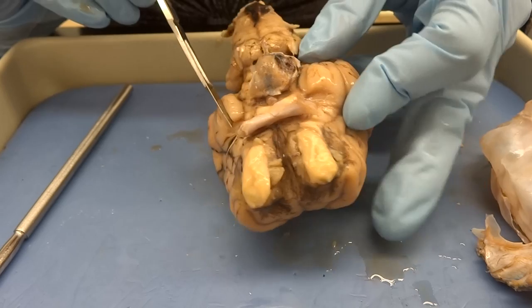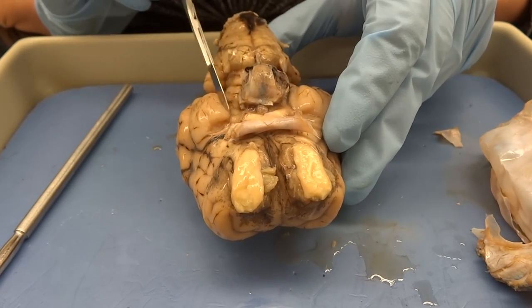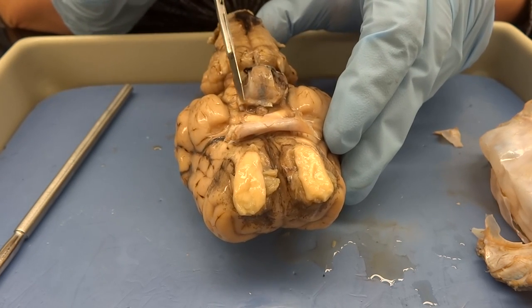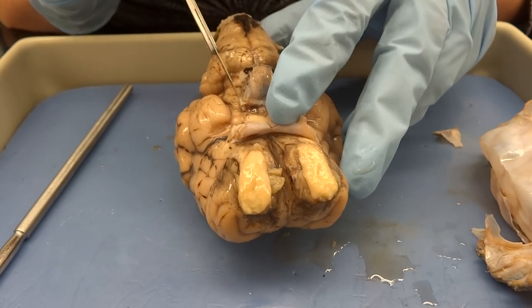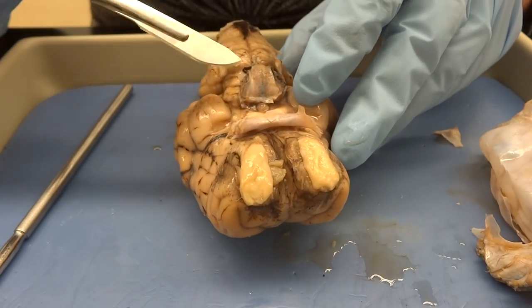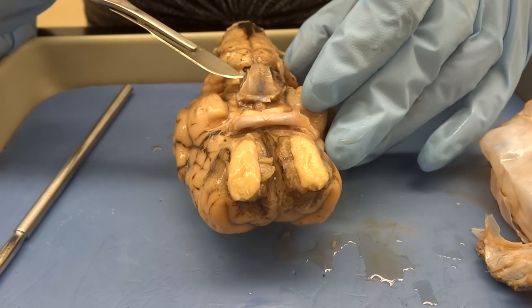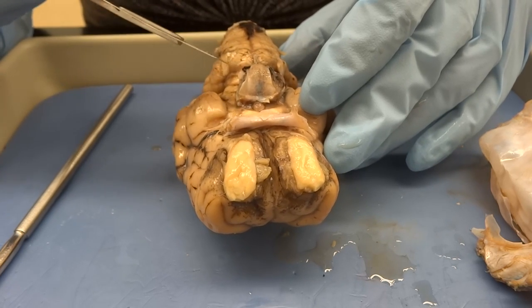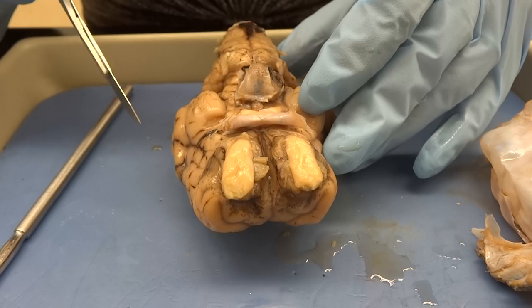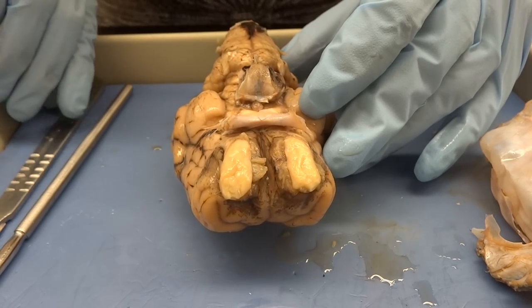Then I turned it over, and you saw before that I had some cranial nerves on either side of the pituitary gland. I found it pretty easy to just slice on either side of the pituitary gland, and then all of that dura mater that was wrapped around the cerebellum just came free. I did leave the dura mater still on the pituitary gland, because I want to save that and be able to look at it from the inside. And I left a little bit on the optic nerve. So just very gently use the side of your scalpel as you take off that dura.